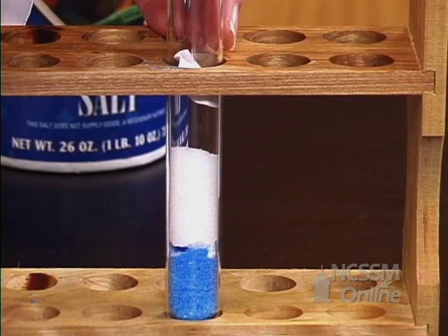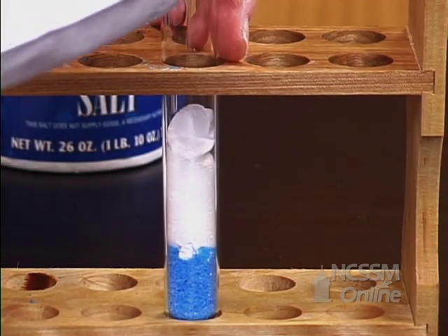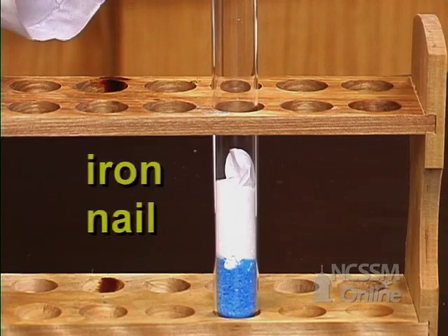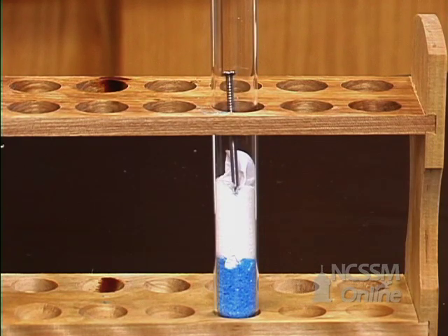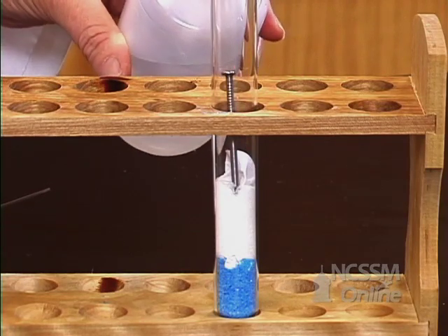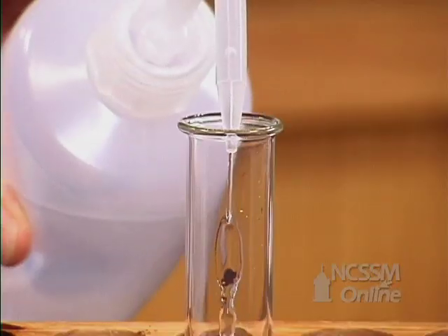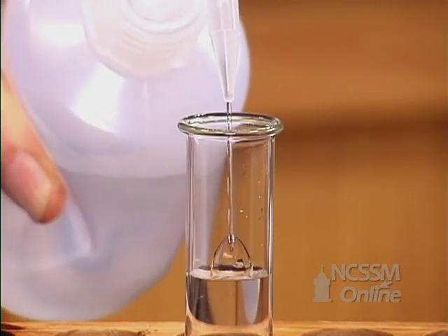And then add another piece of filter paper. When you have your filter paper in place, now take an iron nail and drop the nail in the test tube. Fill the entire test tube almost to the top with water. And put a stopper to keep dust and other debris from falling into it.